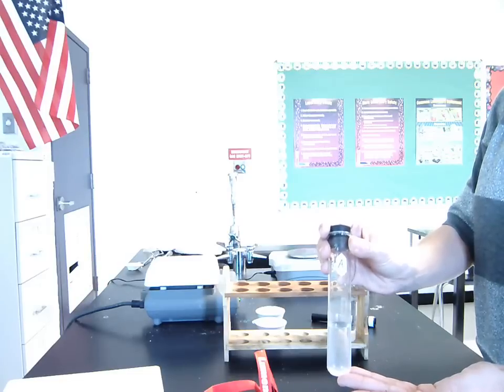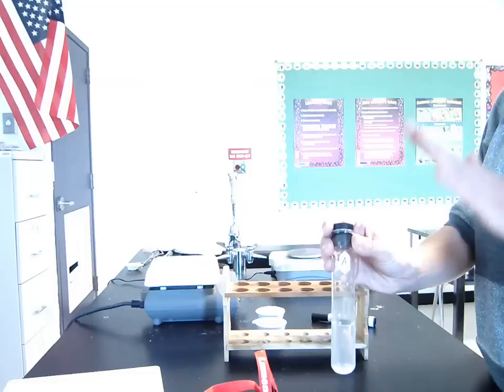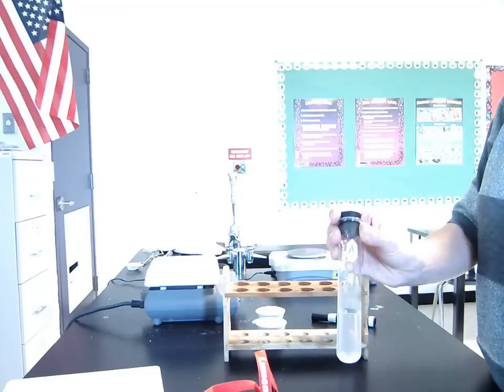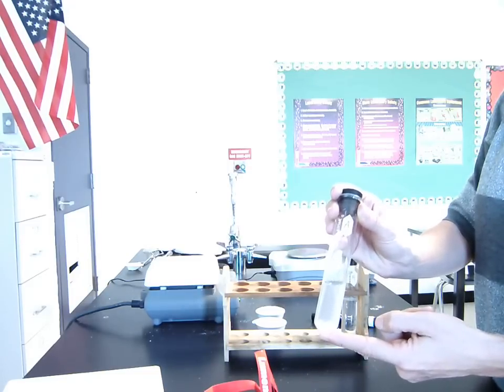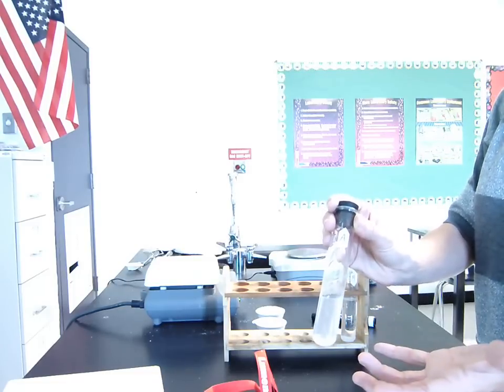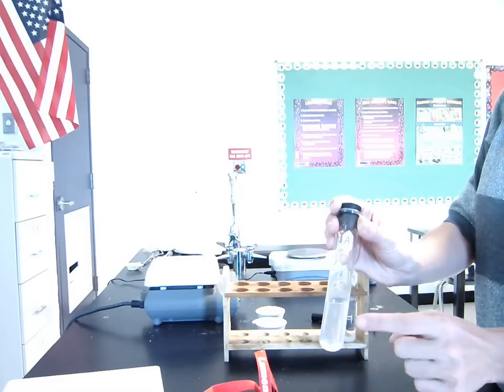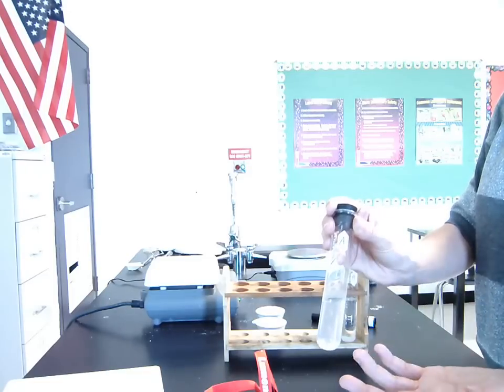So if you think back to our lab from 4.1, the color of the solution was uniform all the way throughout, which means that blue solid dissolved evenly throughout the whole solution. So we're going to take that concept and apply it here. Even though this is a white substance, and when it dissolves we can't see the color, the same principle applies. The solid material that dissolved in the liquid distributes itself evenly throughout the entire liquid. So all I have to do is take a small portion of this solution in order to analyze it.